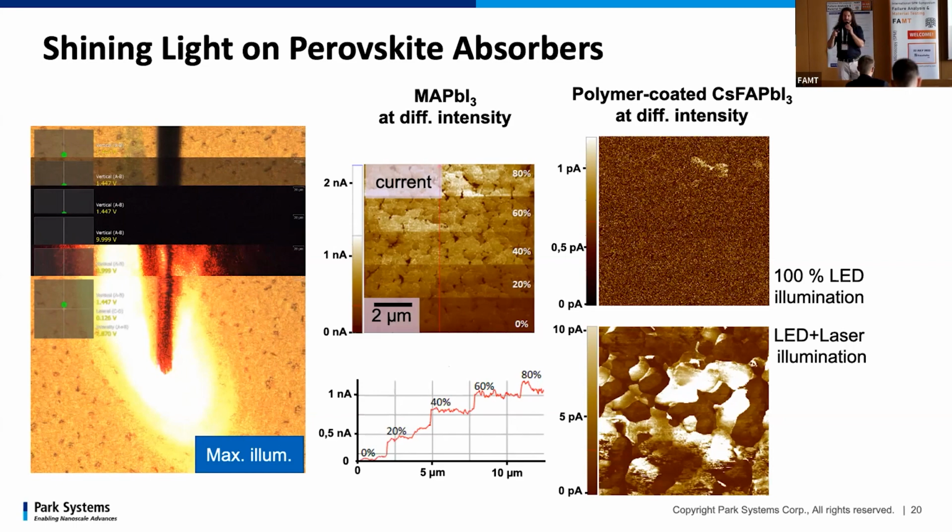In perovskites, you have these octahedral structures forming a three-dimensional network, and in the cuboctahedral voids you have the cation. However, when water gets to the surface, we see a stepwise degradation process. The first step is that we isolate single octahedra and form a small substructure where each octahedron is surrounded by water molecules. So we basically swell the structure at the surface and it becomes insulating. I think this is what we see here.